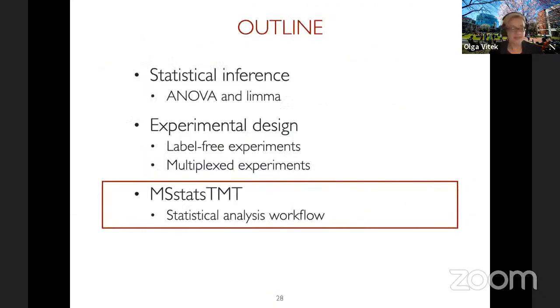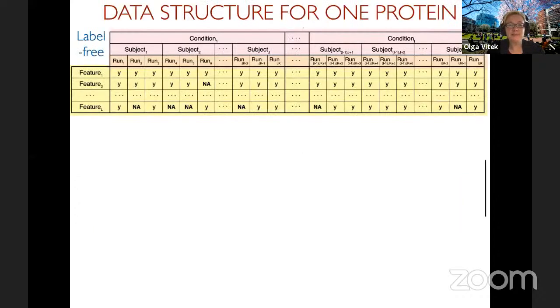Okay, so let me leave these questions for later. Let me first make sure that we talk about MSstats, and then we will try to address some of these questions towards the end. Okay, so MSstats is designed for this type of multiplexed experiments.